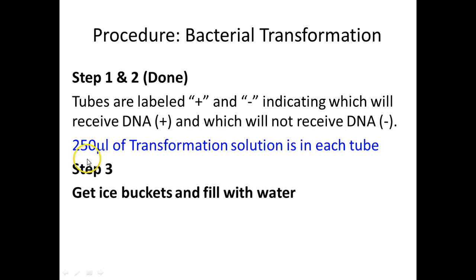They already have 250 microliters of the transformation solution, that calcium chloride solution in them. We're going to get some ice, little containers of ice. We're going to add some water to it. I have some specialized floating racks back by our water bath there that you're going to use to put your tubes on ice.